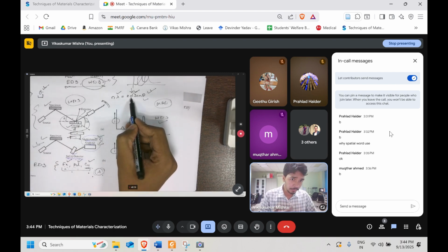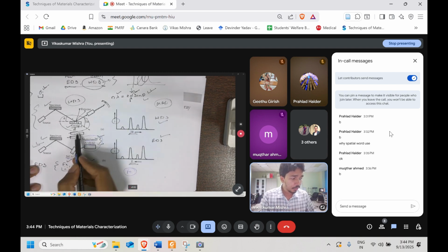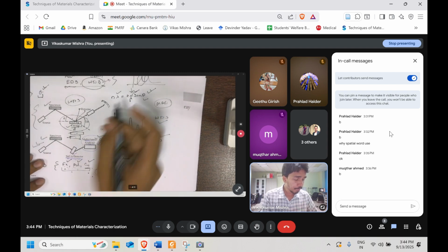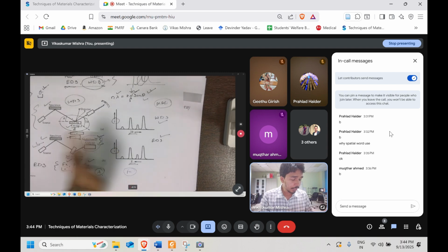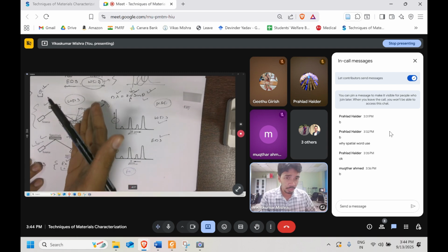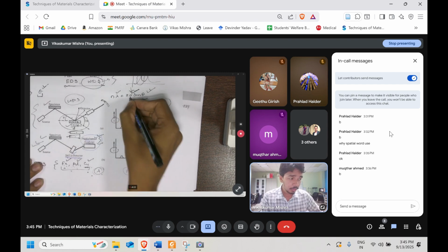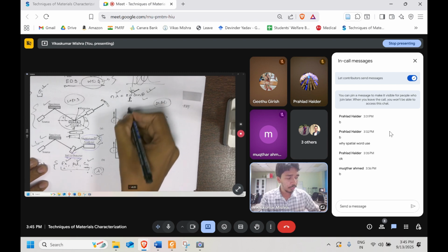We are intentionally putting more and more now. So if one detector you are not using, another can be the one. For example, for a certain particular element, your theta is not in the range of that particular specimen, that single crystal. You need more or less. In that case, what you can do, you can decrease your d, you can increase your d.